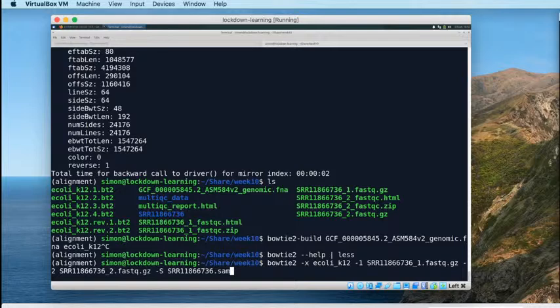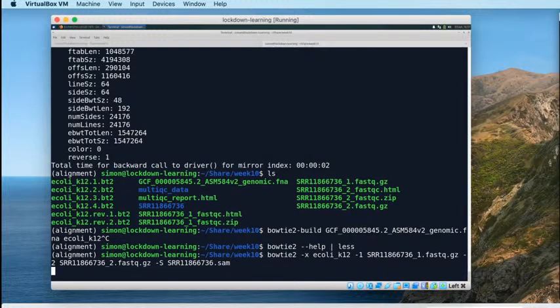That sounds like it will take ages, but I think what you'll see is that even on a single core, which is what this will run on, one thread on a virtual machine, this will be relatively quick. It shouldn't take a huge amount of time. So I'm going to run this. It's going to take over my terminal for a few minutes. Once it's aligned those 1.4 million pairs of reads, we'll get a little report about how well the alignment has performed. That output is actually standard error, not standard output, printed at the end of the process.